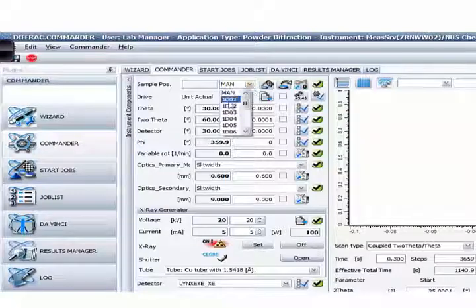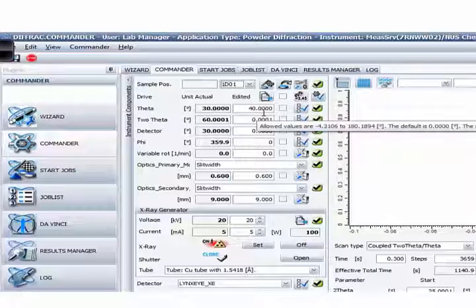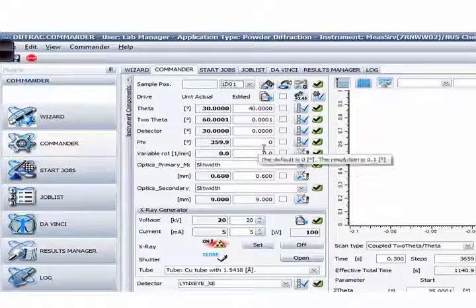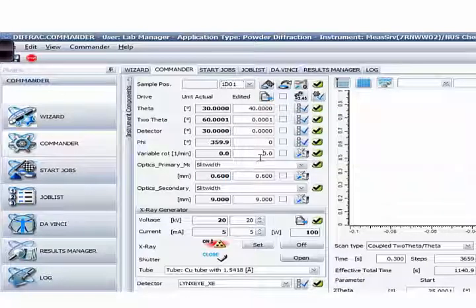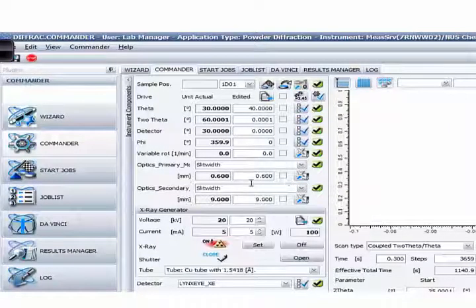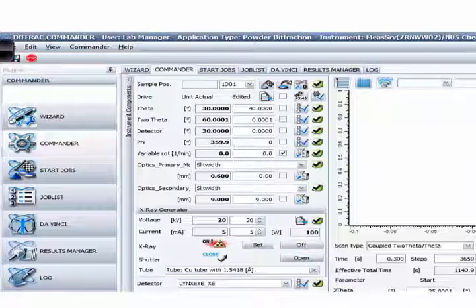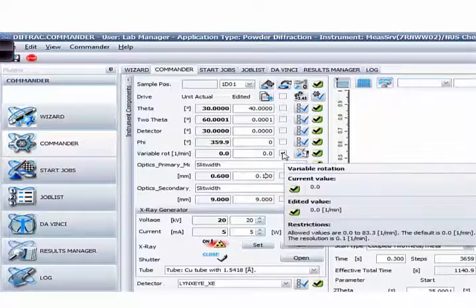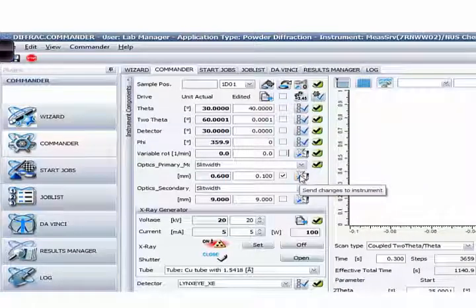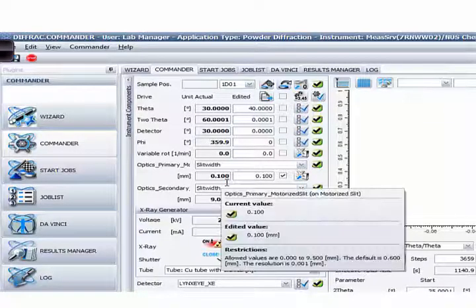From here you can see the theta angle, the detector angle, and phi — which is the rotation of the sample. You can select the speed in RPM. This is the motorized primary slit where you can select the opening in mm. The left-hand side column shows the current setting. If you want to set it to 0.1 mm, just key it in here, check this box, and click 'Send changes to the instrument.' You can see the left column now shows 0.1.